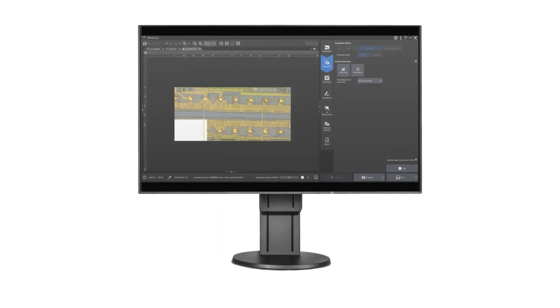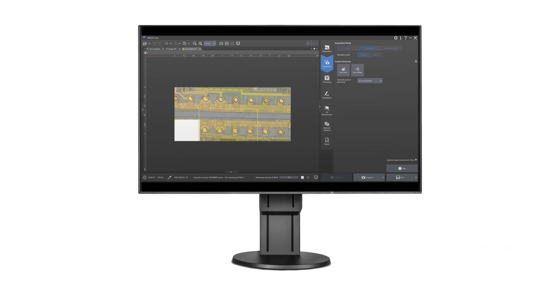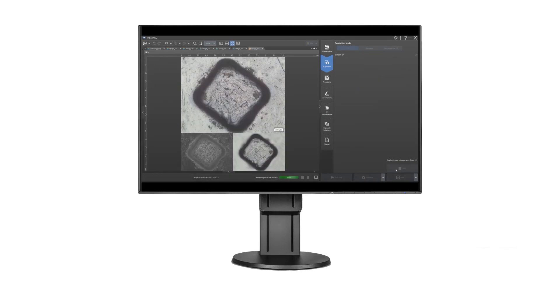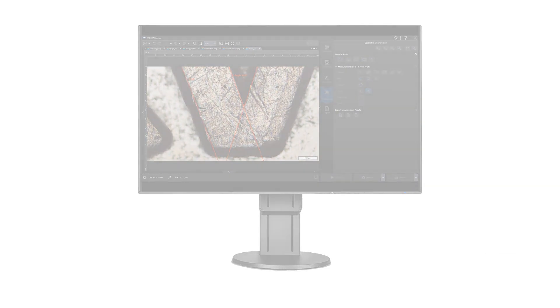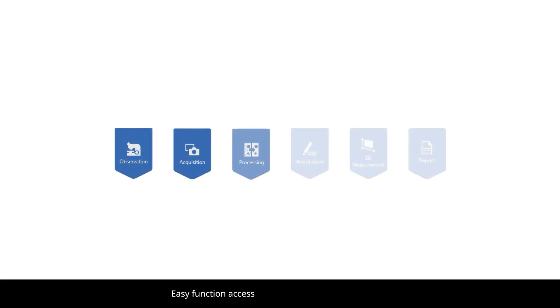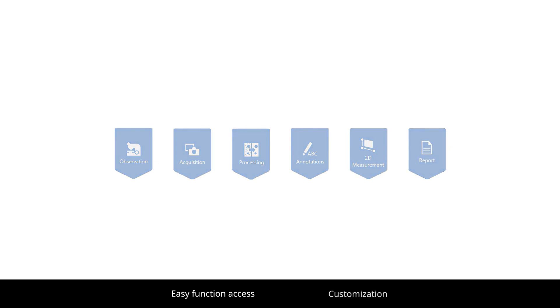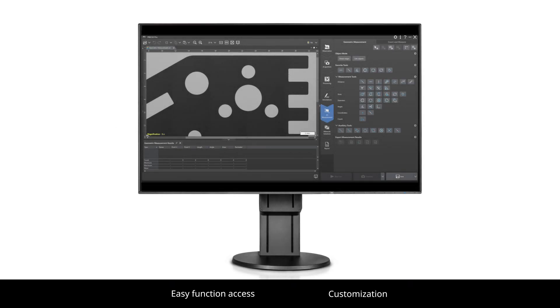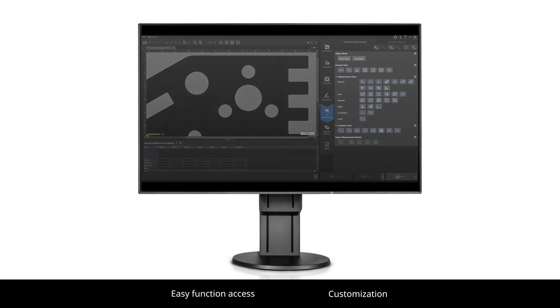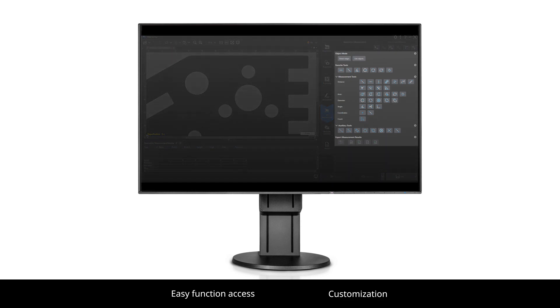Pressive Software enables users with any level of experience to easily acquire images and make repetitive 2D measurements. Intuitive navigation using large, clearly labeled buttons makes it simple to access the software's functions, while the customizable home screen puts your most commonly used features and functions front and center.